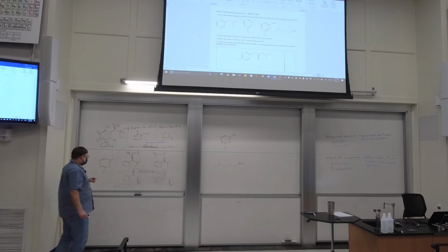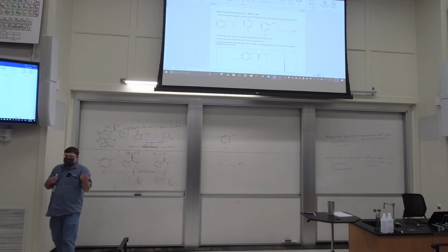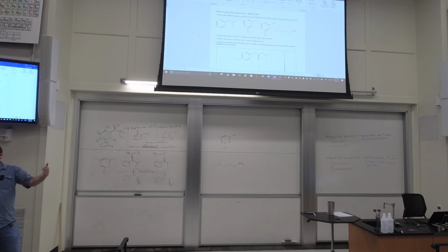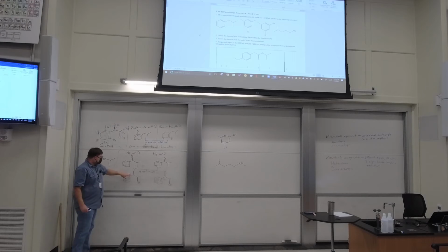In the bottom molecule, an OH and a methyl, they're not the same, so this is now a chiral atom. The carbon that the OH is on is a chiral atom. That means if we had HF and HG on that CH2 position, replacing one with D and replacing the other with D gives us 2 diastereomers. So now, down here, the 2 protons on this position would be diastereotopic.